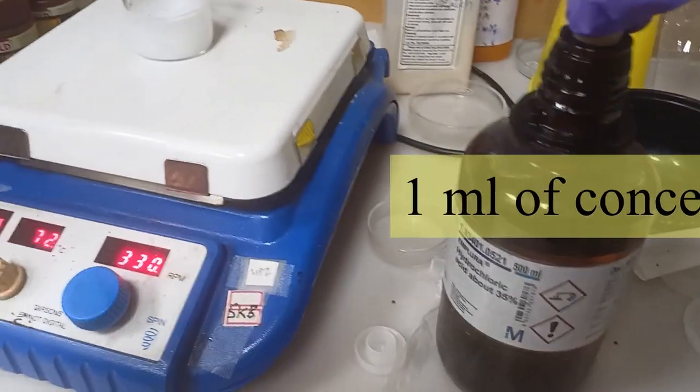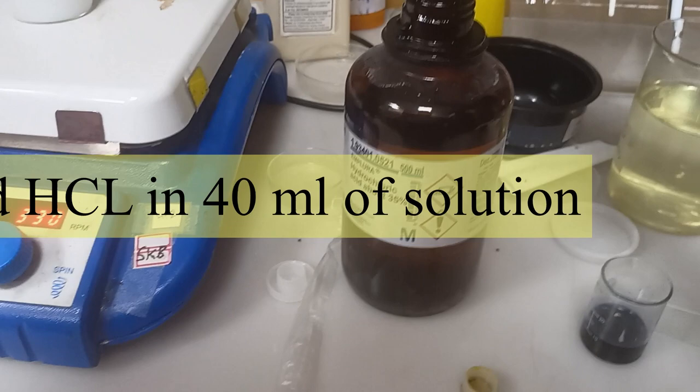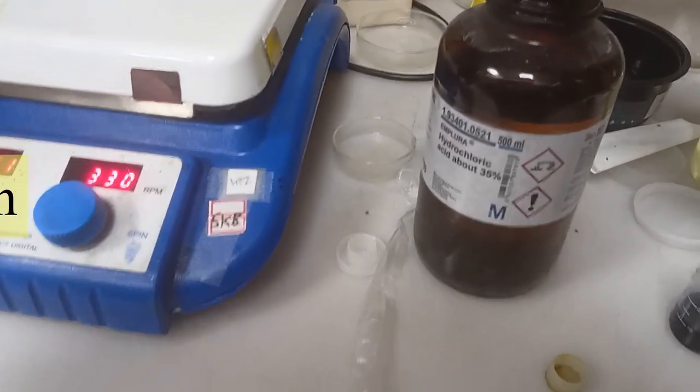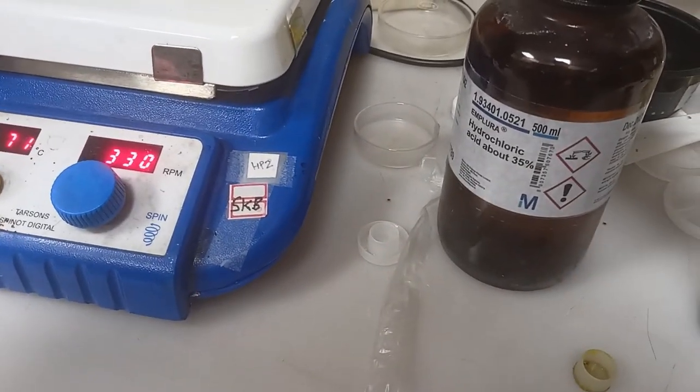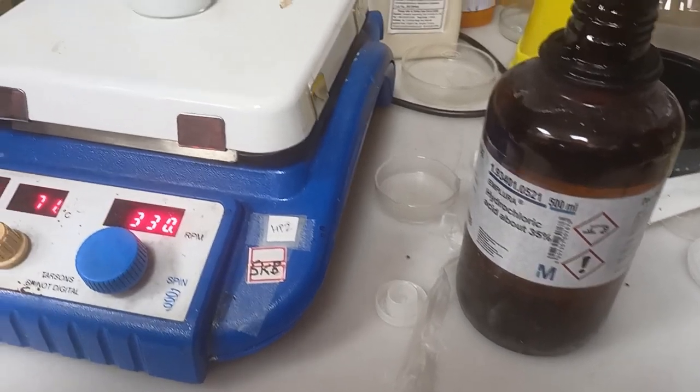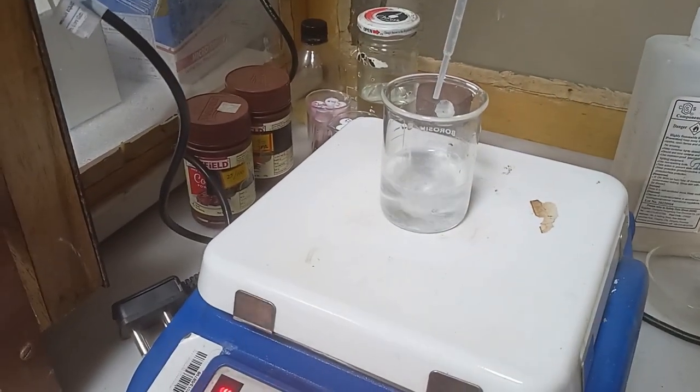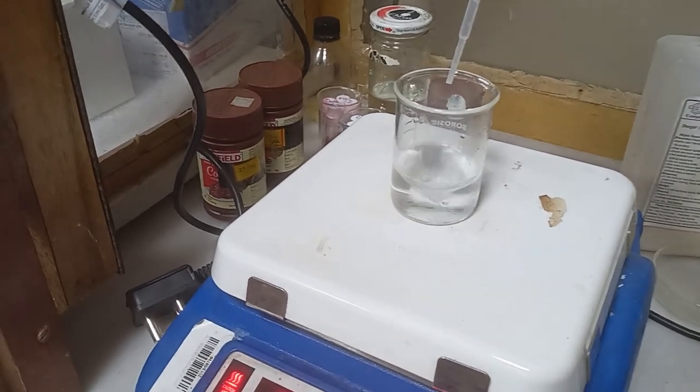Then we need few drops of hydrochloric acid which is highly concentrated, 35%. We will give few drops here and see what happens. As you can see the color suddenly disappeared.